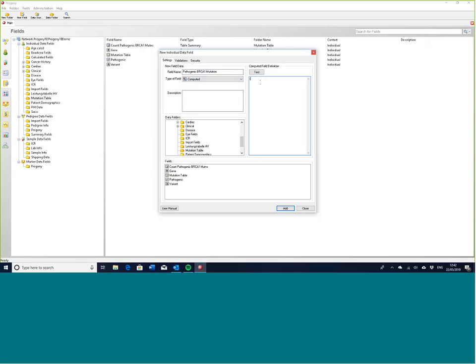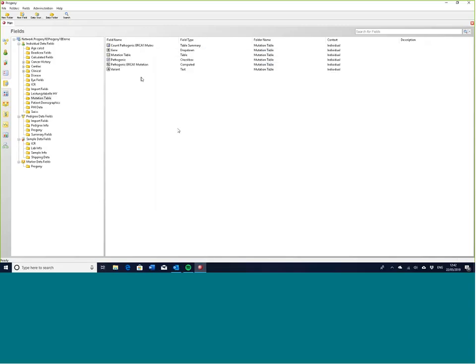I'm just going to use case when, because it's my preferred option. You can expand and change this quite rapidly, so I quite like that. So when this summary field is greater than 0, then BRCA1 pathogenic is what I'm going to create, like so, and then end, close bracket. Let's just click test just to make sure I haven't made any errors, which I have not. Okay, as simple as that. So we can quickly come out with a result for this.